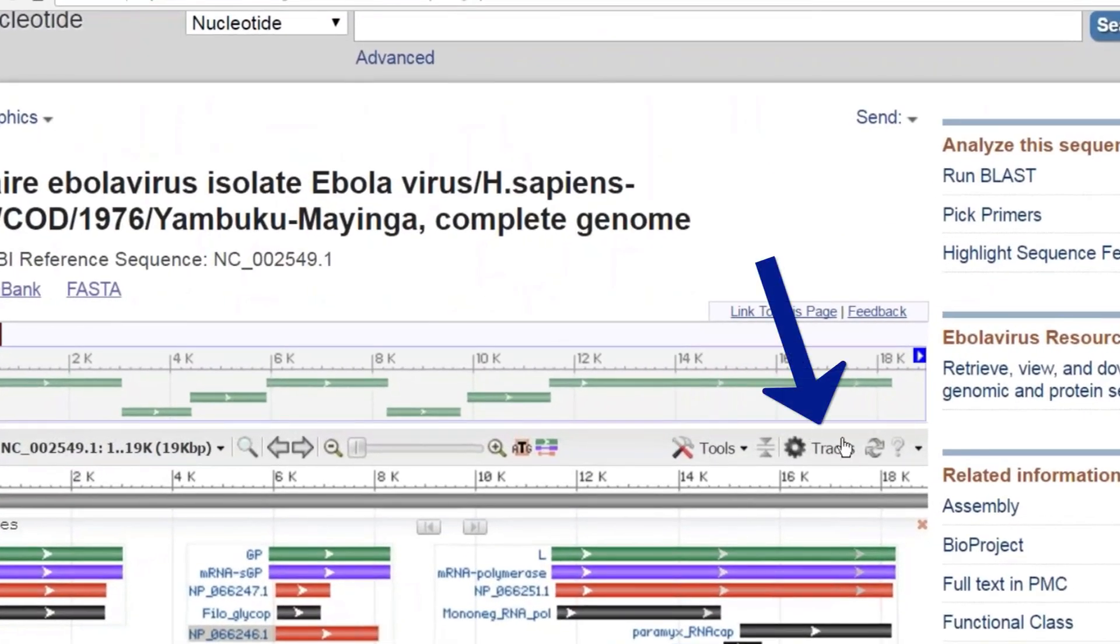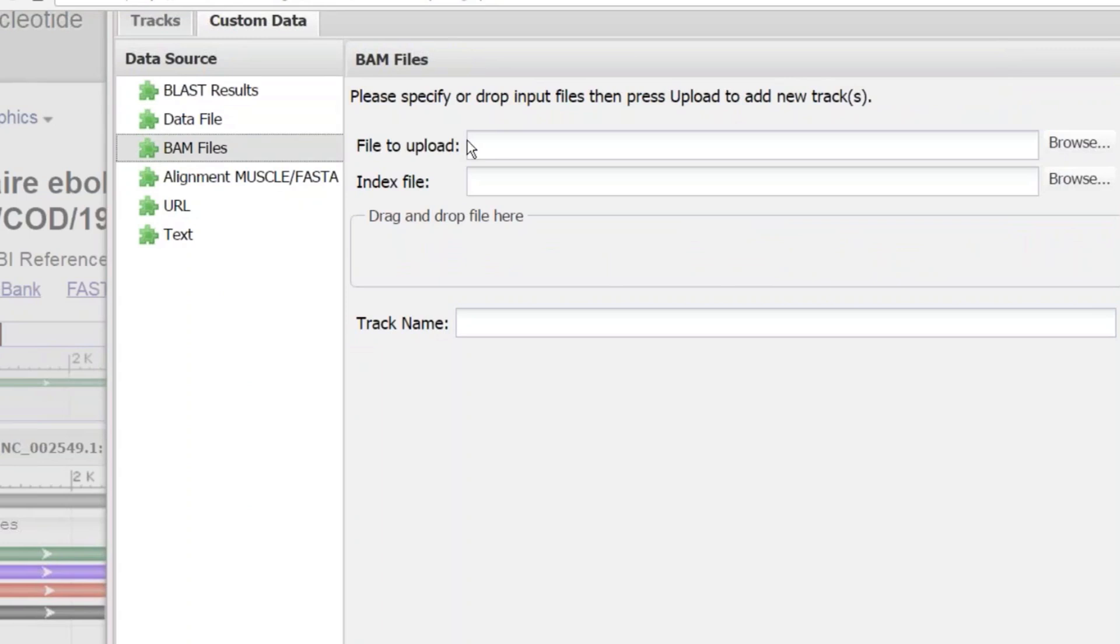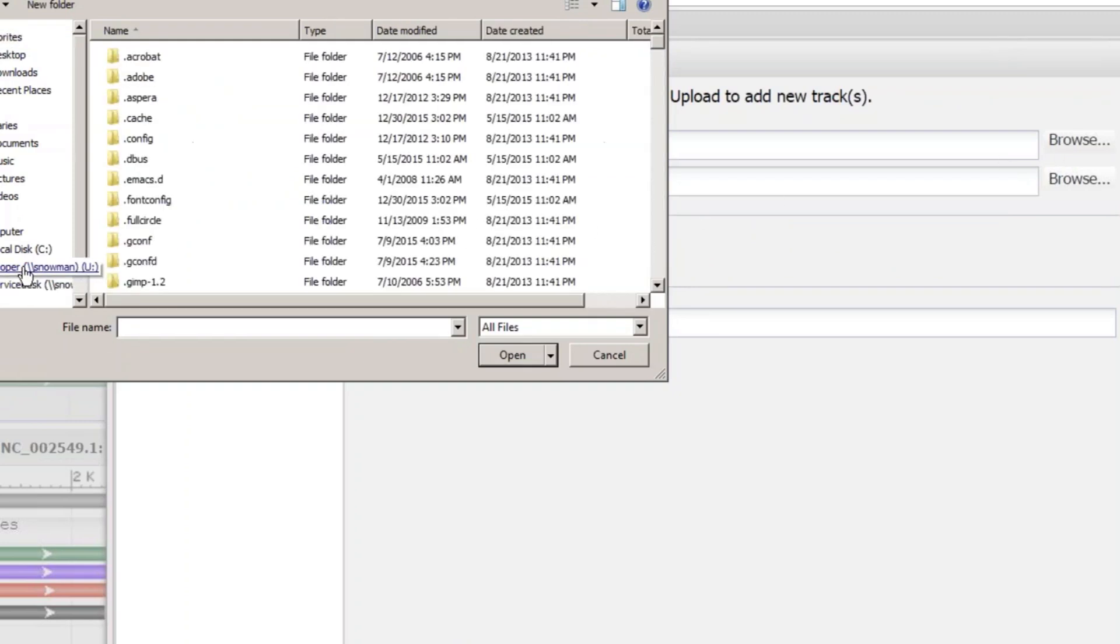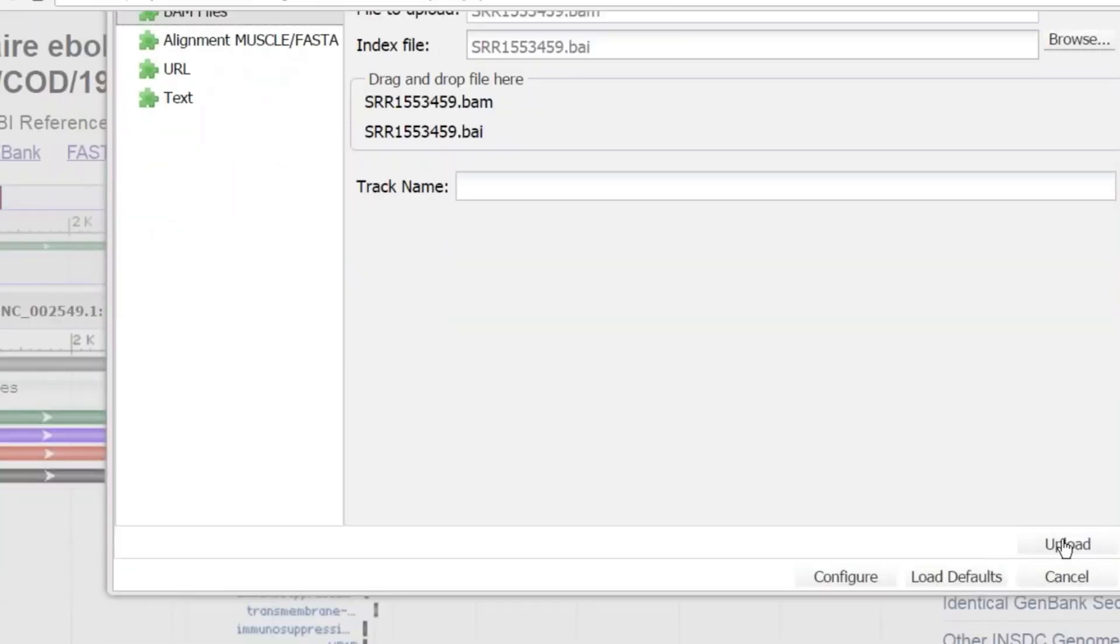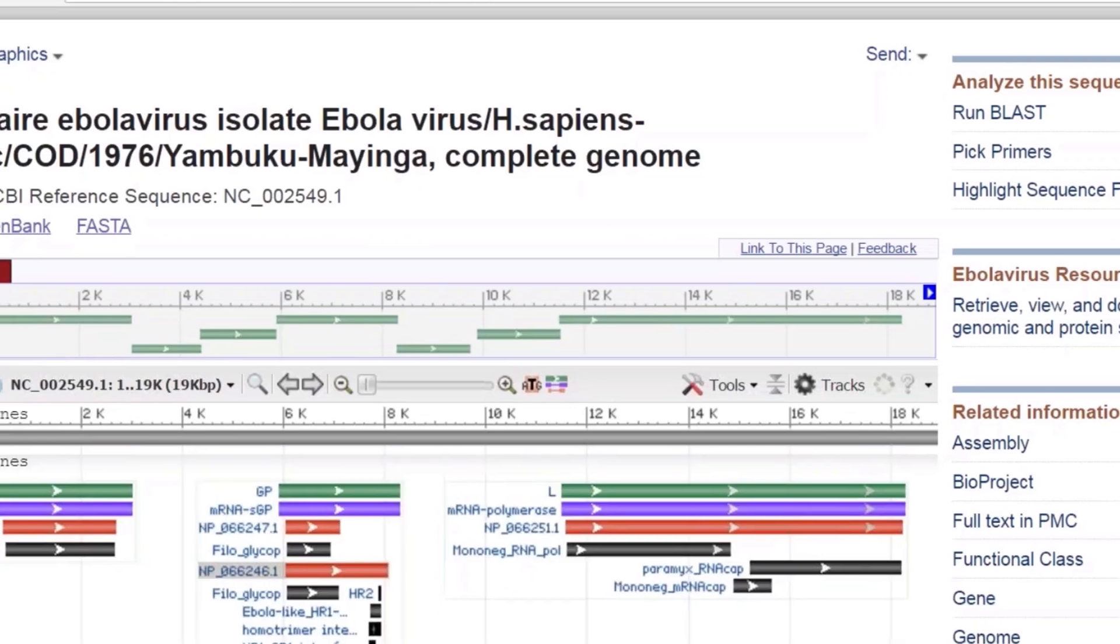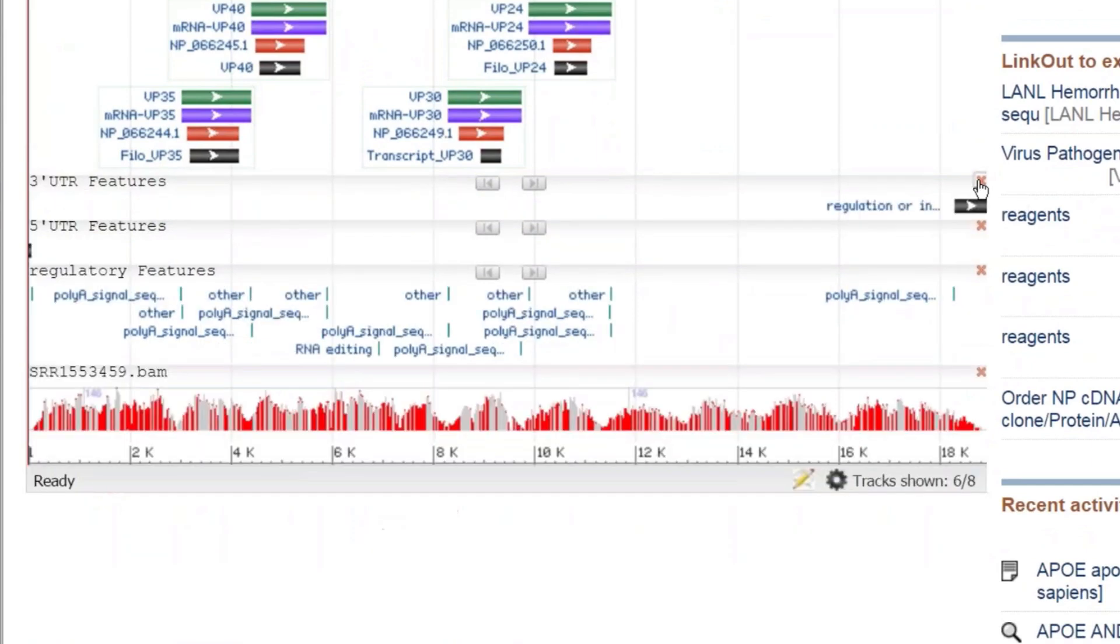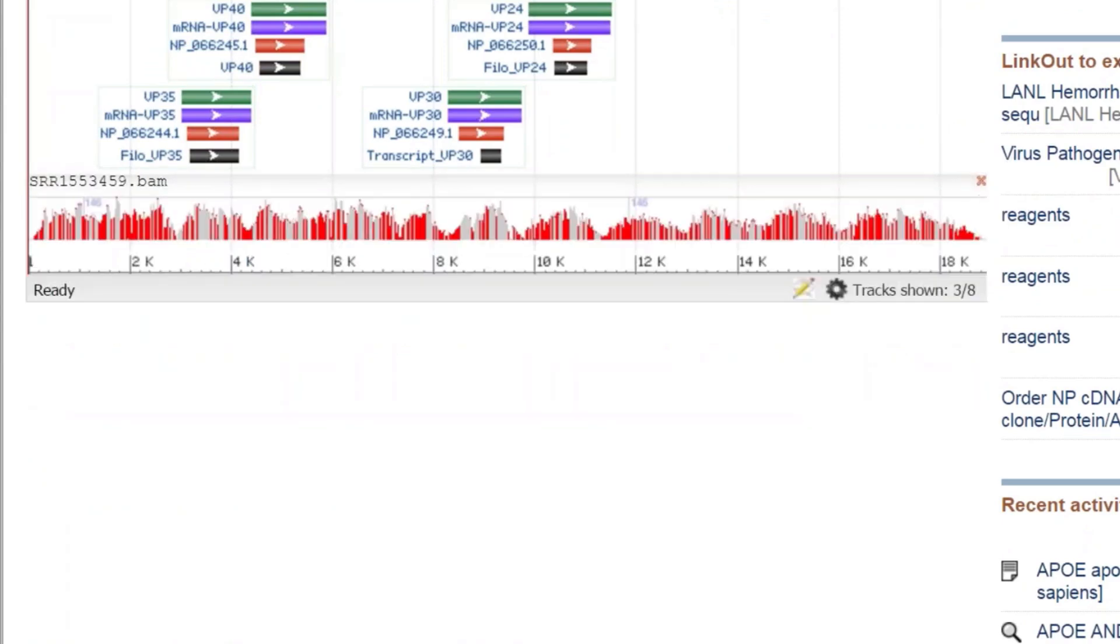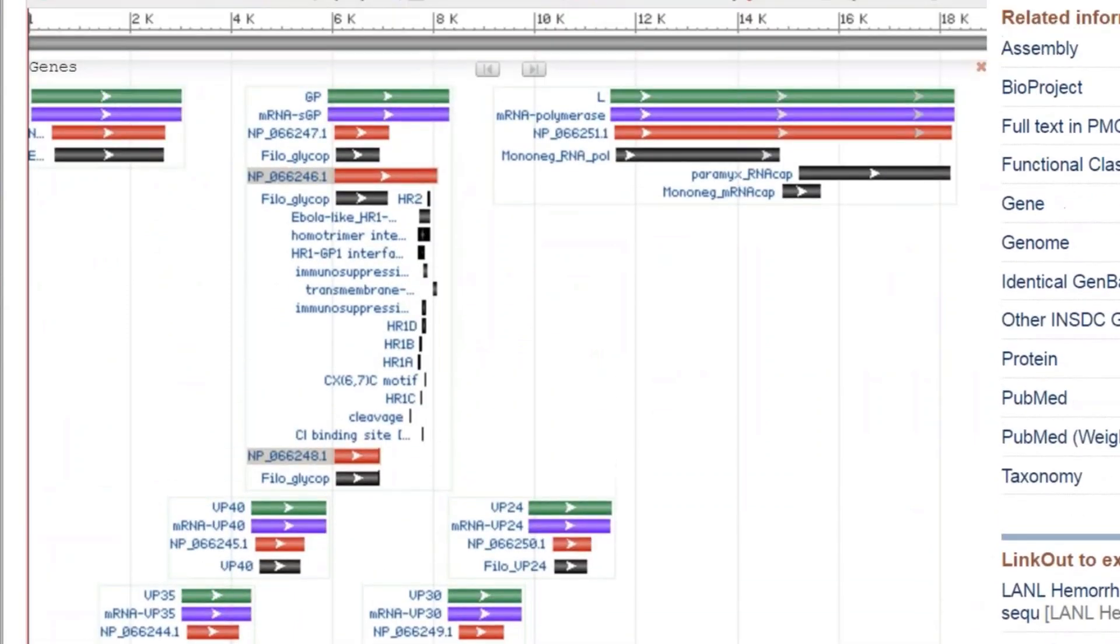I can do that by going to the tracks menu here. Go to custom data. I can select BAM files. Notice that it wants me to upload the BAM file as well as the index file. Go ahead and upload those. And I'll configure that. You'll see that it's now a new track at the bottom. Let me get rid of some of these tracks that we're not going to be interested in. You can see this kind of mountain scape there of the gray and red. The reds are basically places where there are mismatches between the reads and the references.